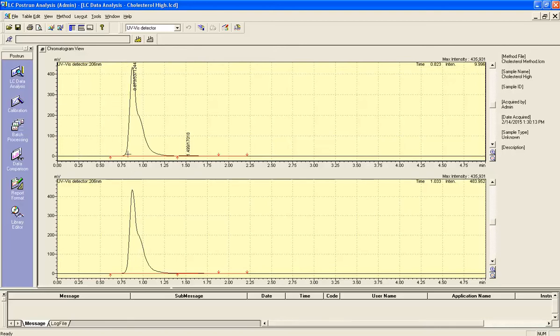This is the opposite. Peak tailing goes straight up, which is what it should do, and it should go straight down, but it doesn't. Instead, it takes its time and wobbles its way through the column and through the detector to be seen.